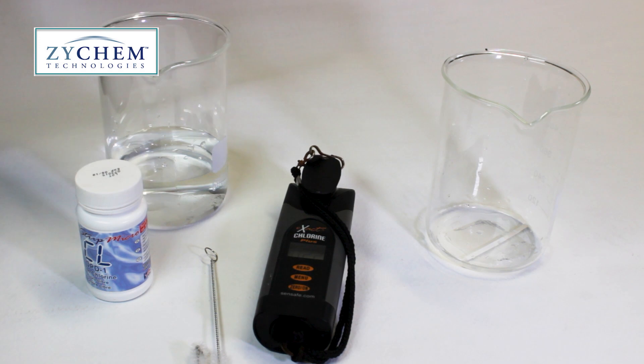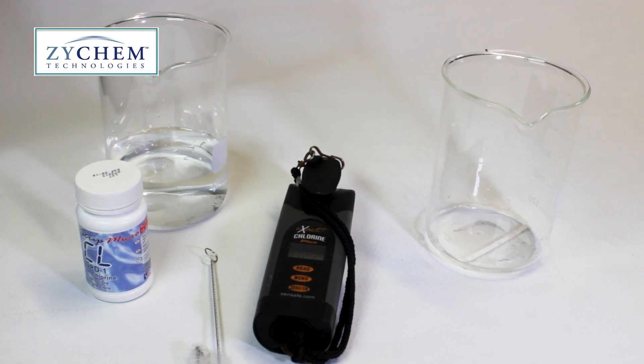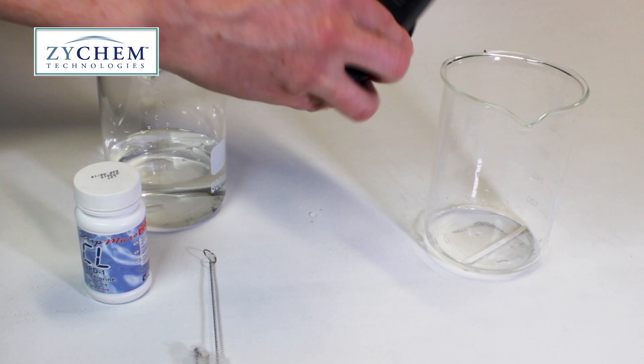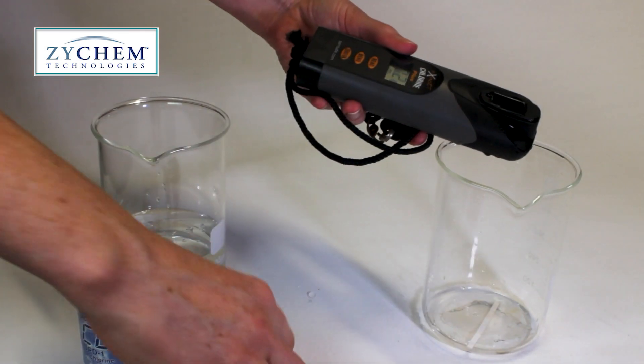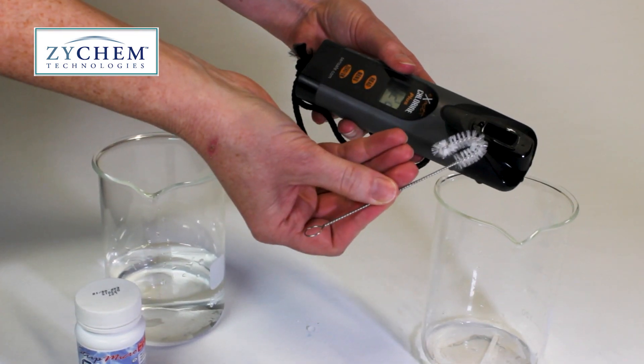Remember at the end of each test, discard the water in the cell and give the cell a clean with a dedicated cleaning brush. You don't want any of the dye from the reagents to linger in the cell and cross-contaminate future readings.